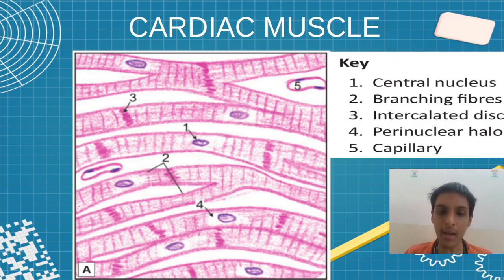Okay. And coming to the striations, it will be very fainter here compared to there. There in skeletal it is easily visible. Here in cardiac not very easily visible. Okay, but will be visible but very faint. And blood vessels also is an interesting feature we can see here. Okay, so this is regarding the three muscles.